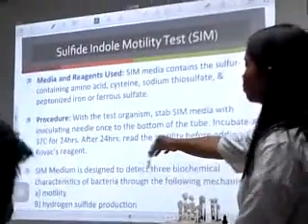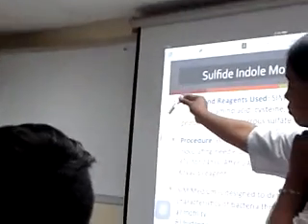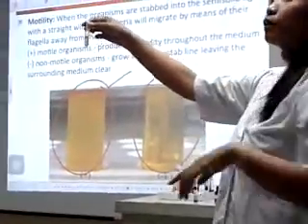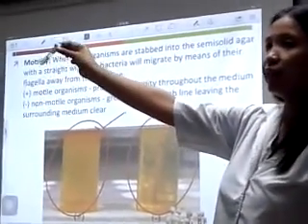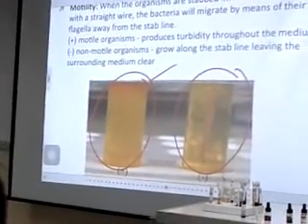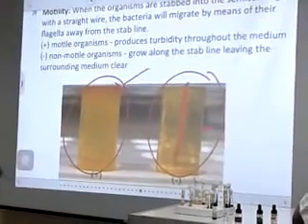SIM — what will you read first in SIM before you add your Kovacs? You read for motility. Motility is seen as turbidity. Did you see the growth spreading beyond the stab line? It will diffuse into the medium. For a negative result, you will only see the growth of the organism in the stab line, and the sides will remain clear.